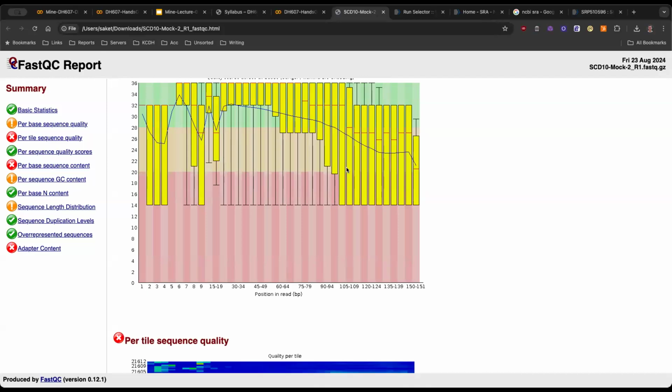The unfortunate thing with polymerase is it doesn't really like to wait. It just wants to keep going. And at some point, it will run out of gas, literally. That's why, as you move along, it becomes harder and harder for the camera to tell very clearly what base it sees. There is a fidelity issue. So there's both a biological and a technological problem that we have. That's why the sequence quality drops as you move along the read.